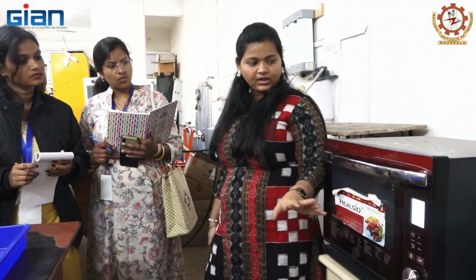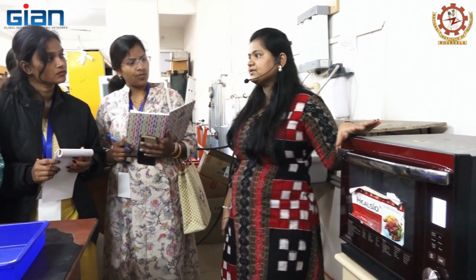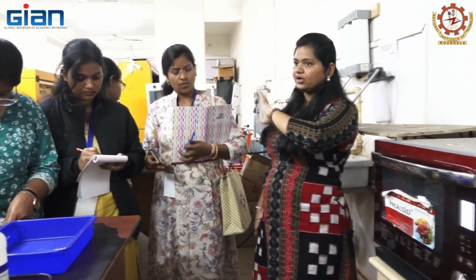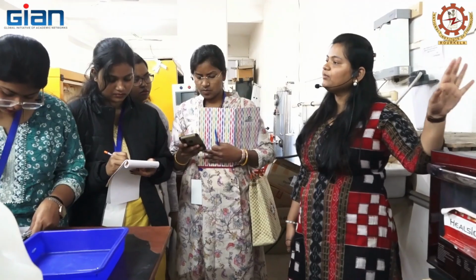Then I will go to the advantages. It takes very little time compared to ultrasound, and it gives a very high yield and higher efficiency in minimum time.